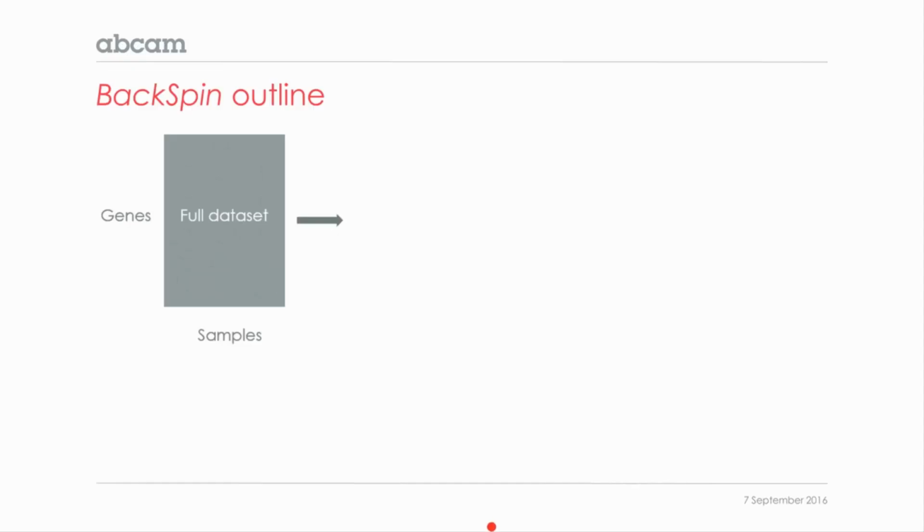So the general theme in the analysis of single cell experiments is that we want to look at heterogeneity. We want to take this full data set, which is genome-wide, so what you get is a big matrix. You have genes on the rows and samples or cells on the columns. And now what you want to do is get clusters or groups of co-regulated, or groups of similar cells. And we call them clusters in this analysis.